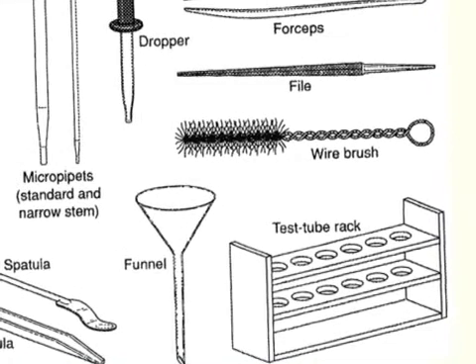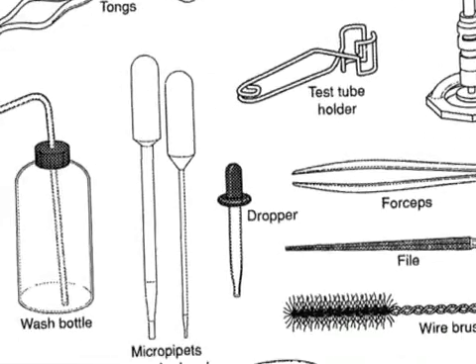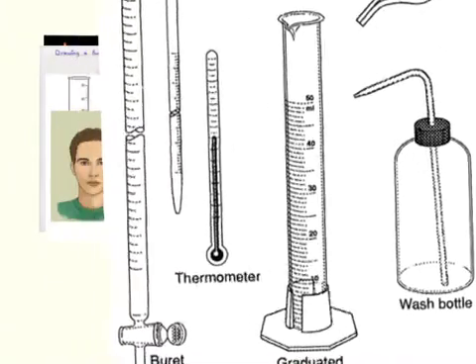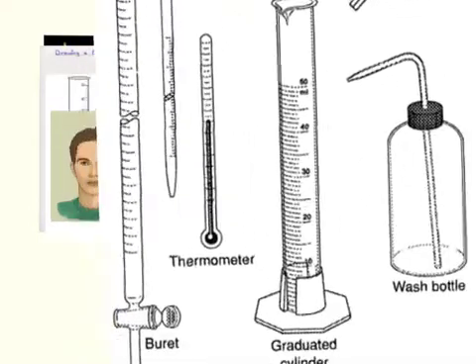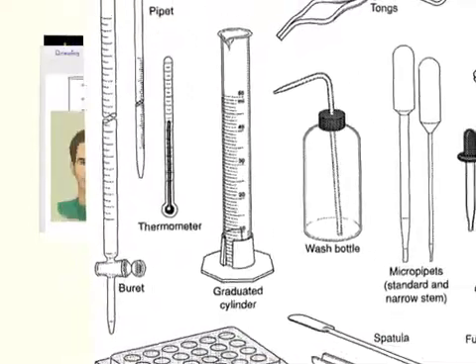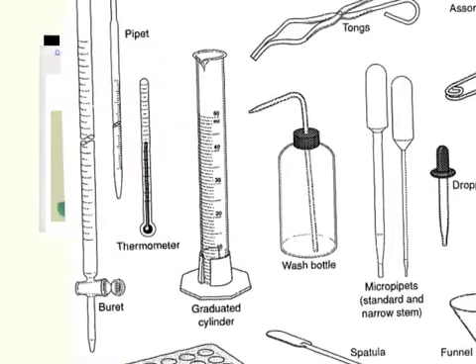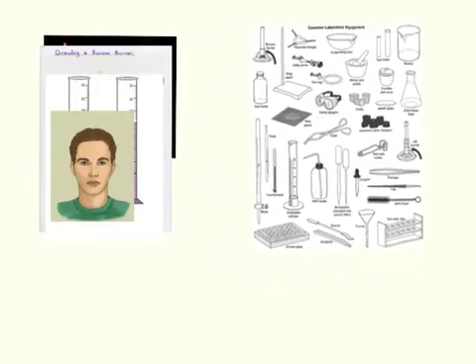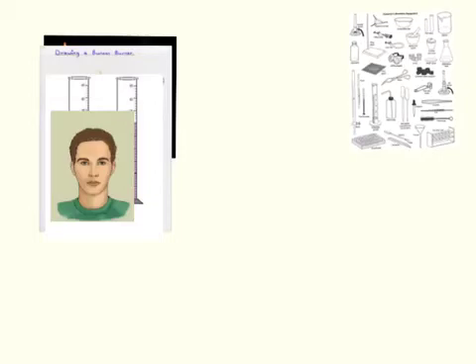Wire brushes are for janitorial purposes. We won't use forceps and files too much, or a lab burner. Next, we want to look at a thermometer. A thermometer comes in whenever we start looking at exothermic and endothermic reactions. And then, last but not least, we have a graduated cylinder. We're going to go in depth on the graduated cylinder in just a little bit, but we use it to measure smaller amounts of liquids. At the end of this, I will leave this slide large so that you can use it to study whenever we start talking about our lab quiz.